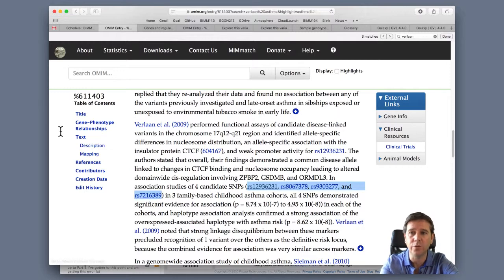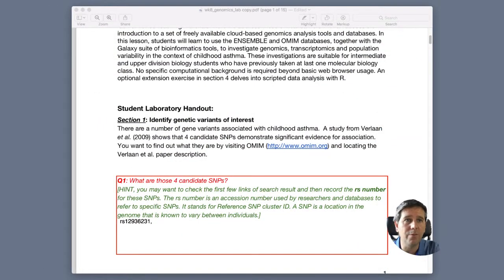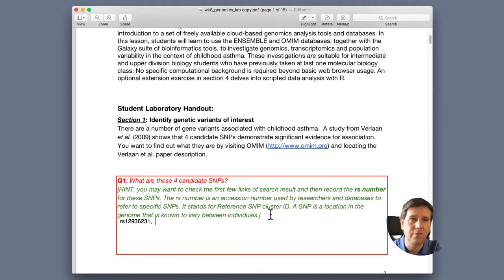And then I'm going to go put those in my PDF, so that I make sure I keep a record of my answers as I go through. So here I am back here, and let's see if my copy paste will work now. Nope. Okay, we'll figure that out after. So we've got our different SNPs that we can add here. I'm going to go and explore some of the other ones while I fix my pasteboard.